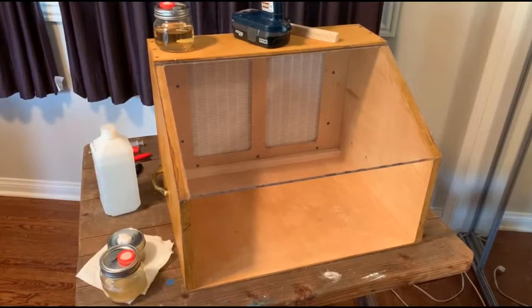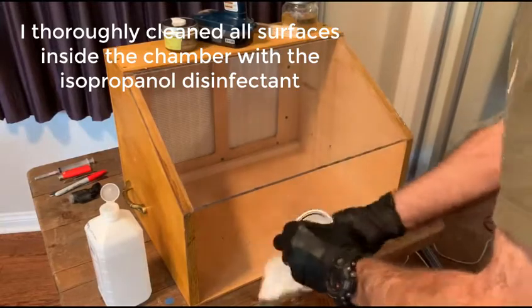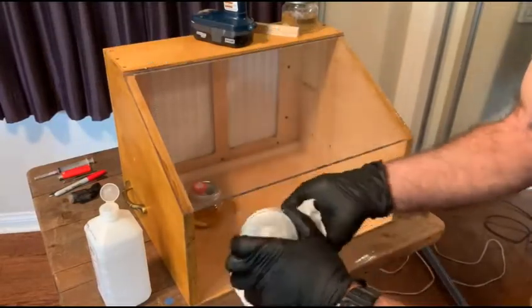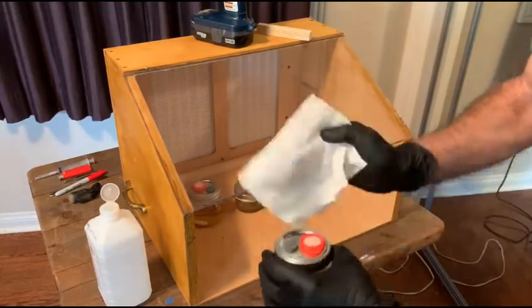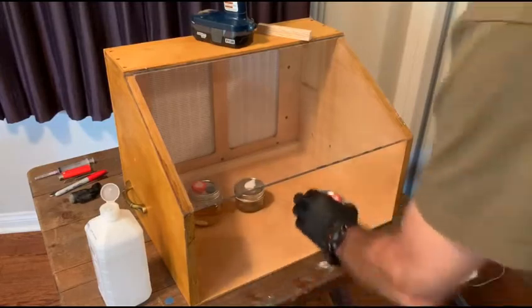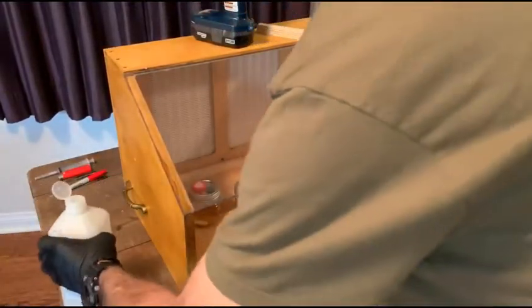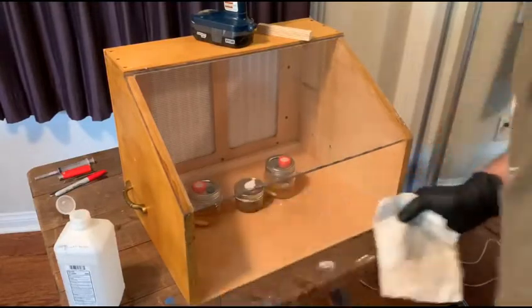I wait for 10 or 15 minutes to allow any contaminants that have landed on the HEPA filter and in the box to be removed by the airflow, and then I will clean the box. Everything that goes into the box gets sterilized, or at least wiped down before it goes in.